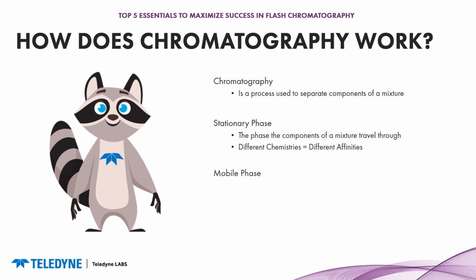We're also going to talk about mobile phase. And again, the mobile phase is exactly what it sounds like. This part is going to be moving. This is the phase that's going to carry and move components of a mixture throughout the stationary phase.